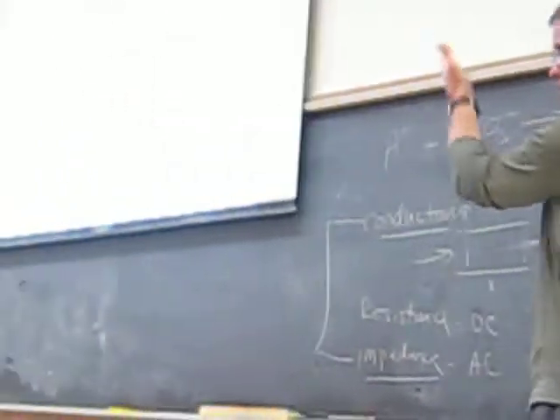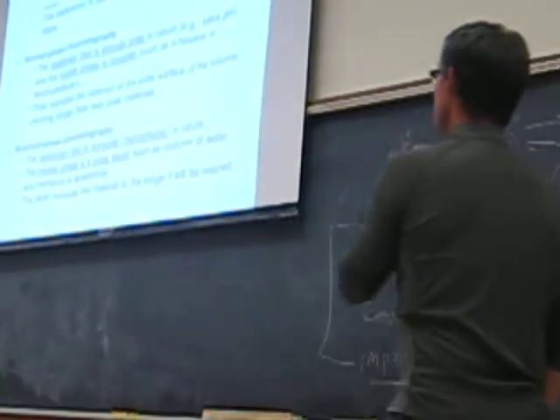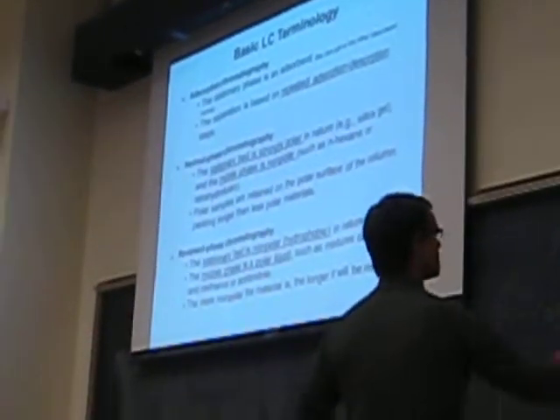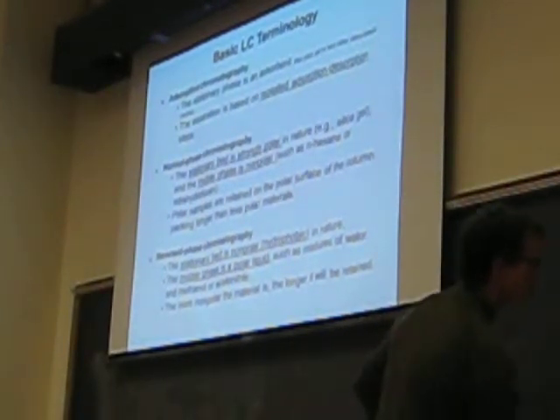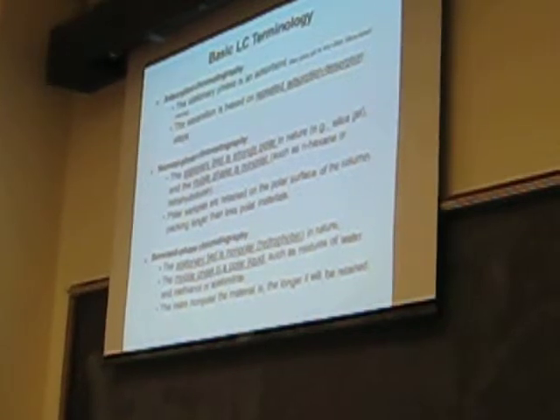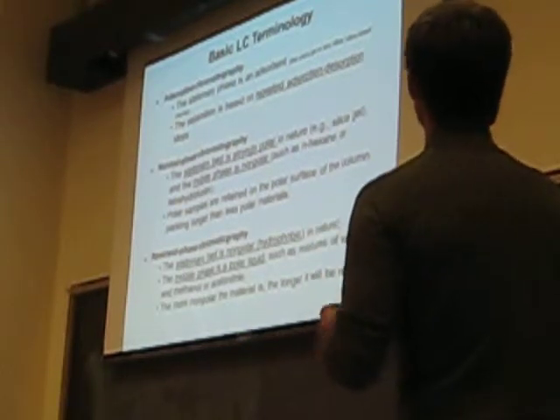That's across different kinds of chromatography. And so I think we want to get a clear idea of these different forms and how they're used and what the basic separation processes are, because this is kind of what drives what we might start thinking about if we had to adopt a methodology.